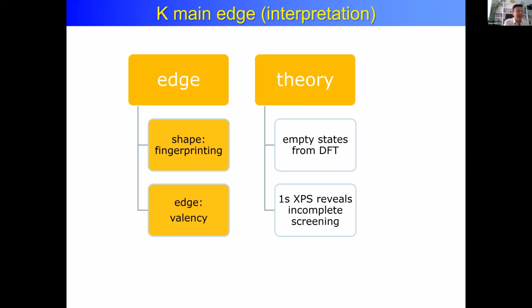Yeah, I assume that it's both in the initial state and the final state, at least. Amelie handled the calculations, but that would be the normal approach, to take the same U in the ground state and then the final state. Of course, in the final state you have the core hole potential, which is another parameter in a way. Yeah, that's what I was.